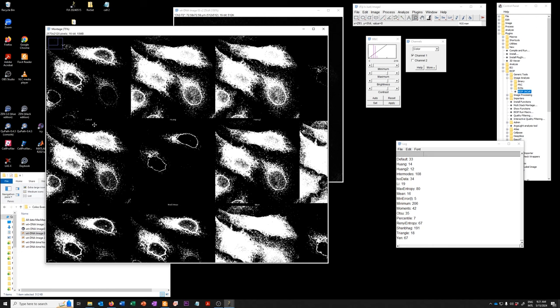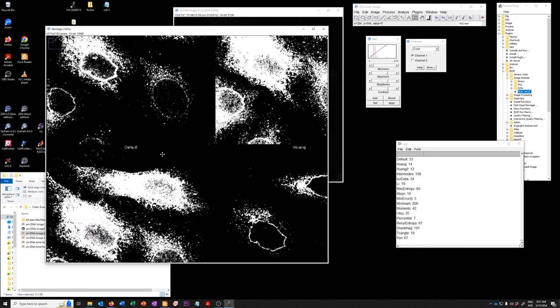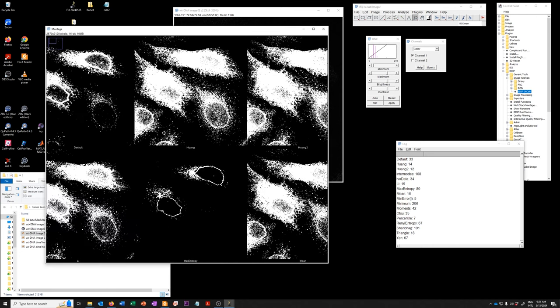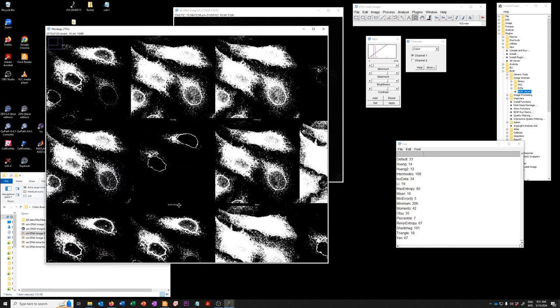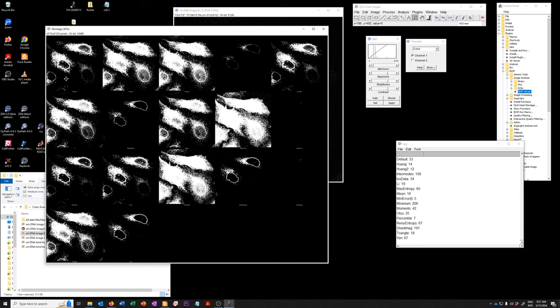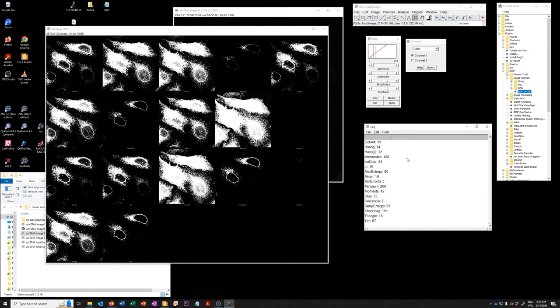It says if you zoom in you can see it says default Huang, Huang2, maximum entropy etc etc. So you can see the results of the different methods and then you can see the intensities that were calculated for each of those. And so this is a nice way of exploring.